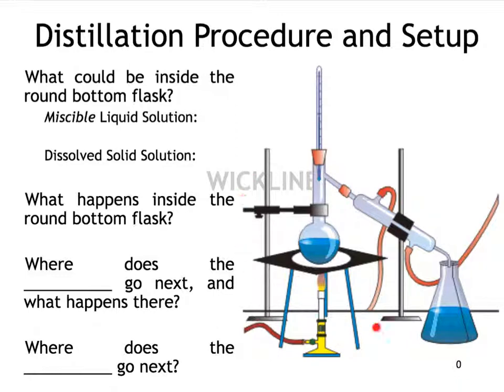We don't even have access to this equipment in our lab, so we can't do it for lab, but I can explain it enough that you will understand how it works. It's called distillation, and you definitely take great notes about this one. But you have some very basic sort of science equipment, such as a round bottom flask.